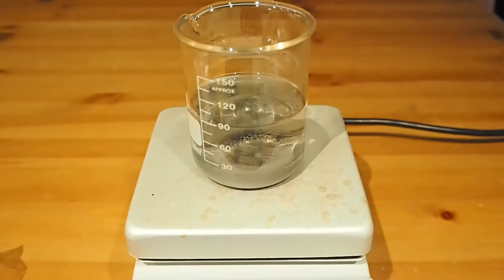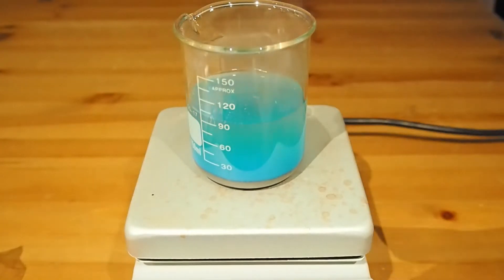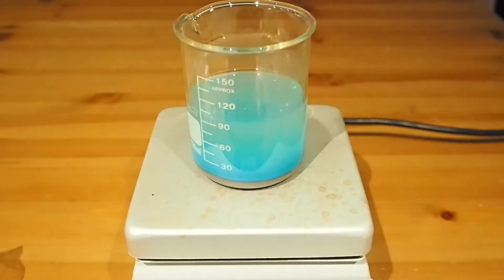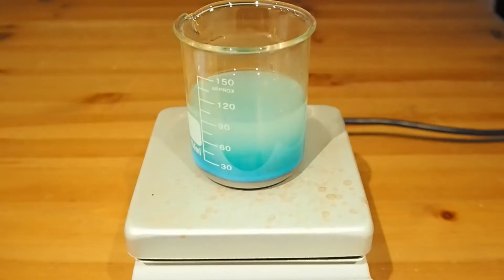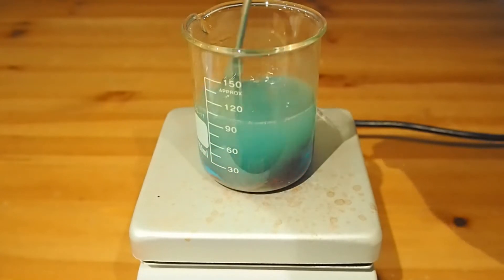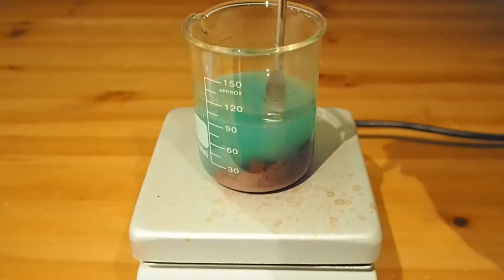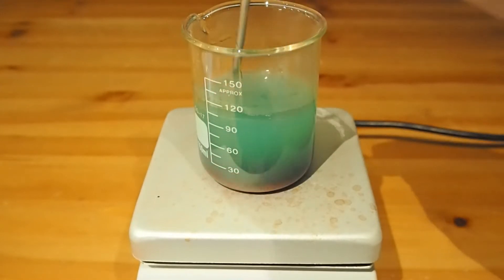Now this isn't terribly nice stuff so you should do it really holding gloves. I'm going to wash my hands straight after, and I'm just going to put a fair quantity in. You can see it's already beginning to react. You're getting the red copper deposit on the iron.